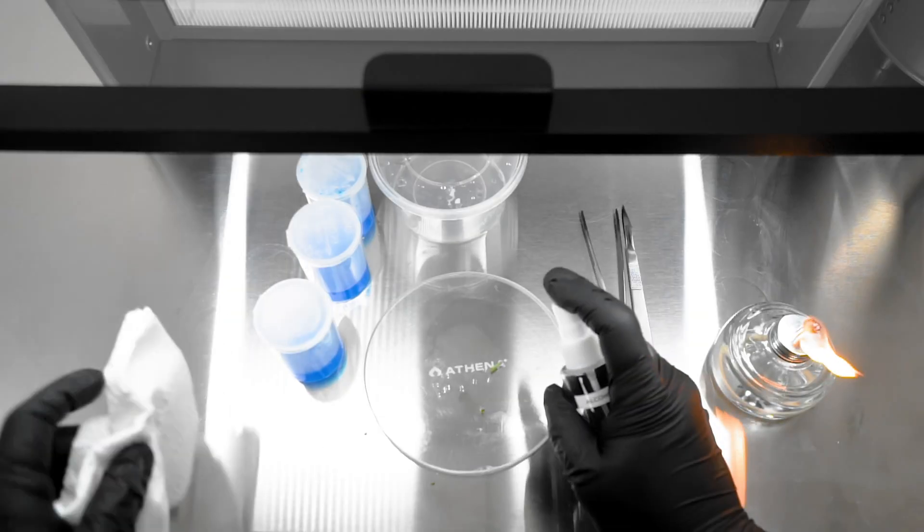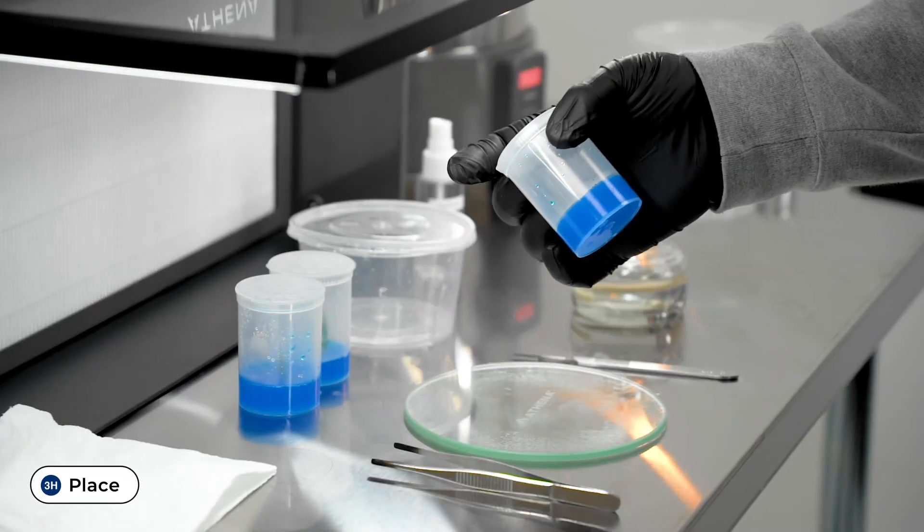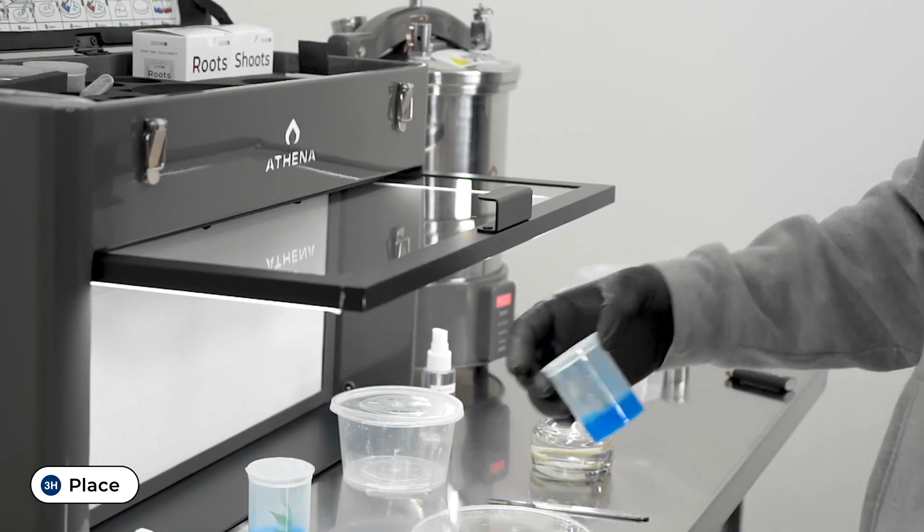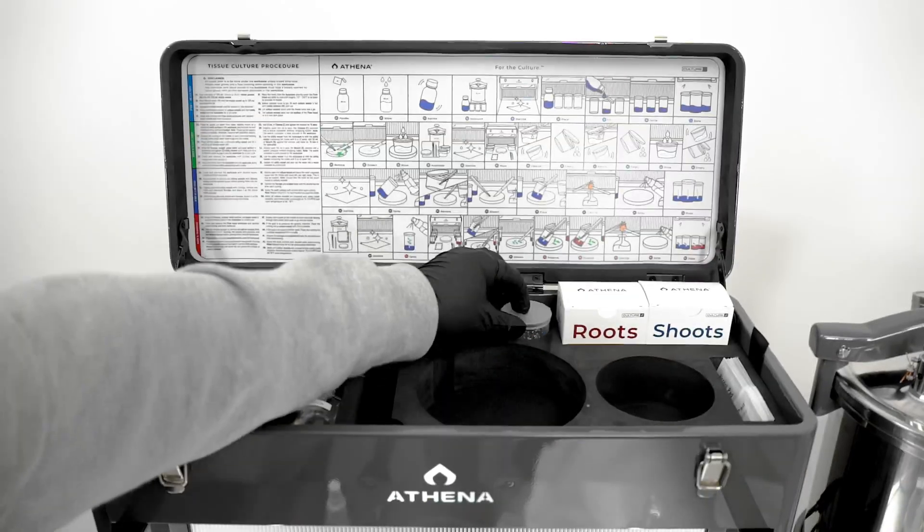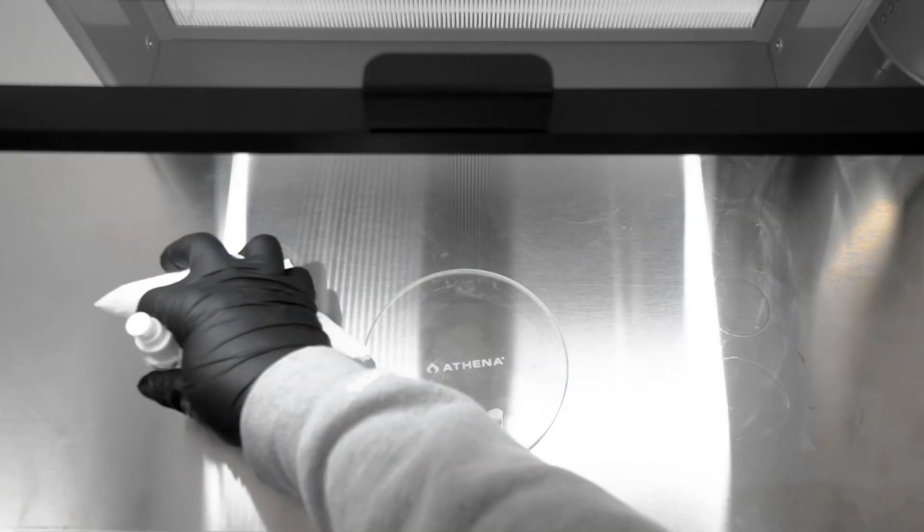When all culture vessels are prepared with newly made explants, store them under a clone light at 75 to 125 ppft and a room temperature of 68 to 78 degrees Fahrenheit.